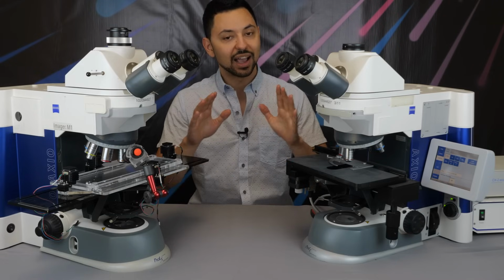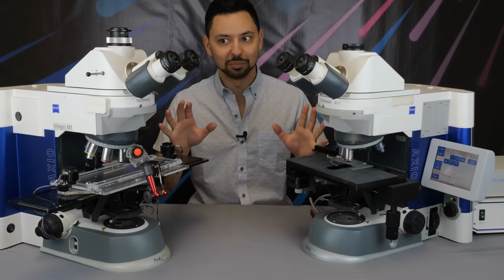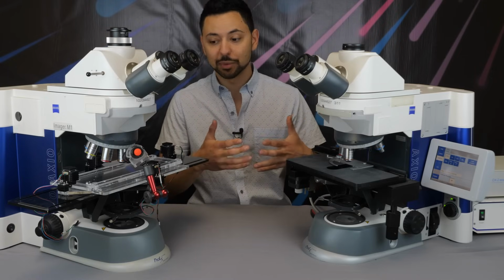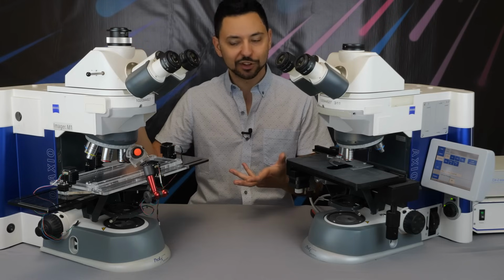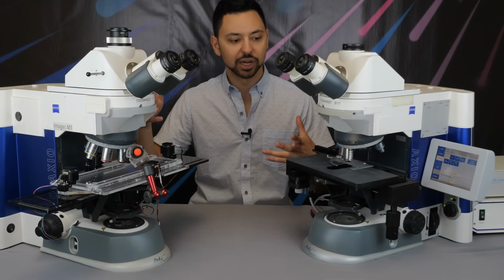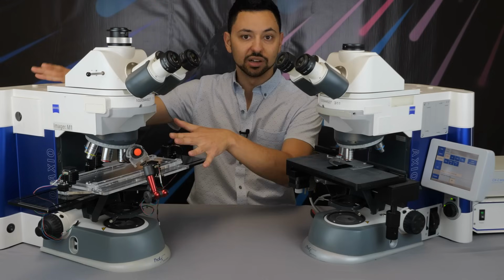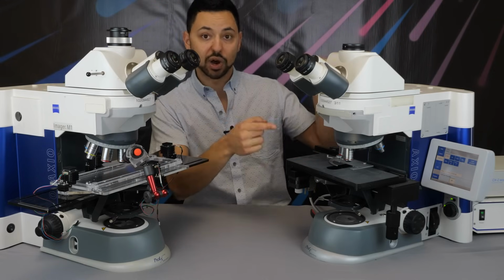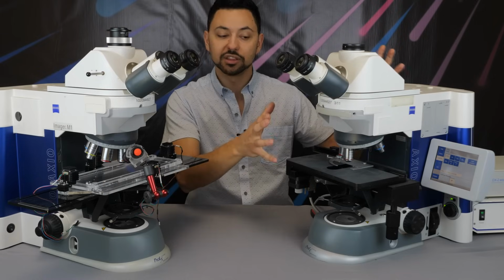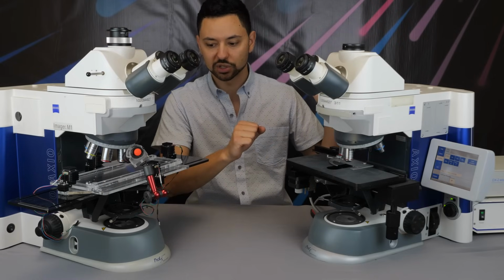They come as is. Part of the deal here is that they need a lot of cleaning and they need some upgrading. So this has actually been kind of a fun project for me, upgrading this microscope, finding new components for it, making some of my own custom components. This one here is mine. This one I'm just borrowing from that nonprofit so that I could make this video to show you one of the vanilla versions of this microscope.